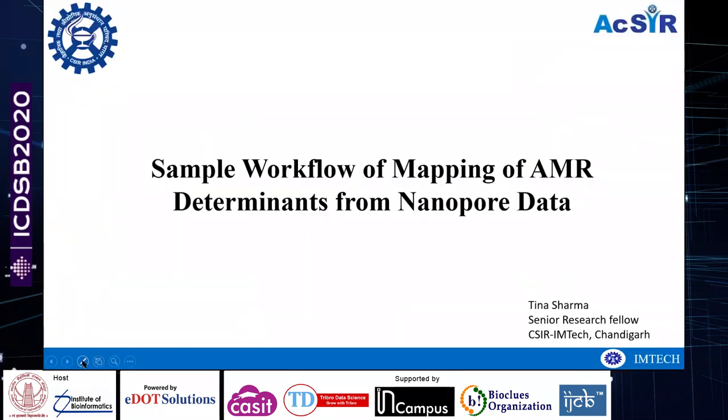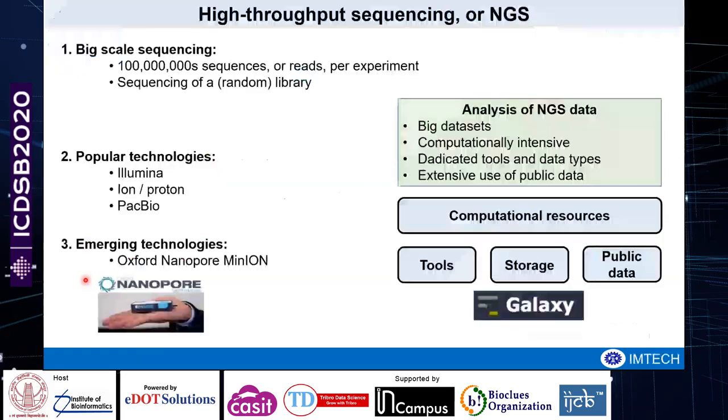Today we will be discussing a sample workflow for mapping AMR determinants from nanopore data. Basically, in this session, we will be discussing how workflows work in Galaxy.